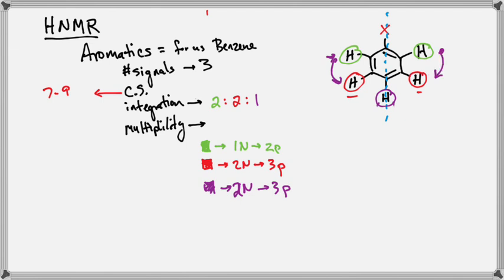It's the same thing. In the other scenario, that purple hydrogen can see both. It's still a single hydrogen that sees both, not different hydrogens seeing one neighbor. Which gets a little bit wonky, I fully acknowledge and admit, but that's what's happening in that system.